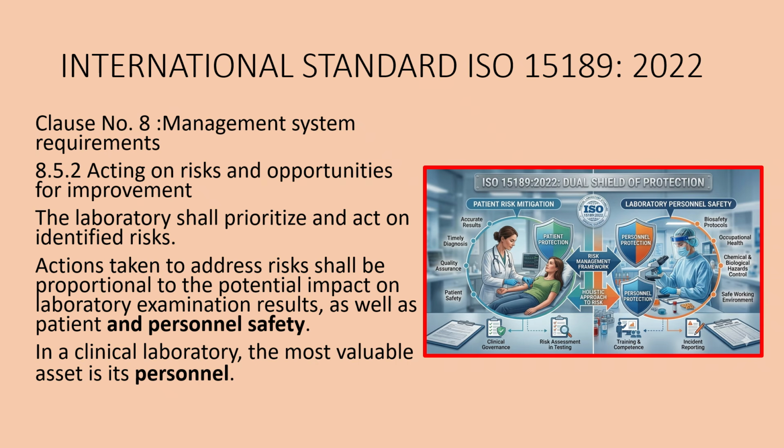We begin with the international standard ISO 15189-2022. Clause number 8, Management System Requirements. Clause 8.5.2, Acting on Risks and Opportunities for Improvement. The laboratory shall prioritize and act on identified risks. Actions taken to address risks shall be proportional to the potential impact on laboratory examination results as well as patient and personnel safety. In a clinical lab, the most valuable asset is its personnel.